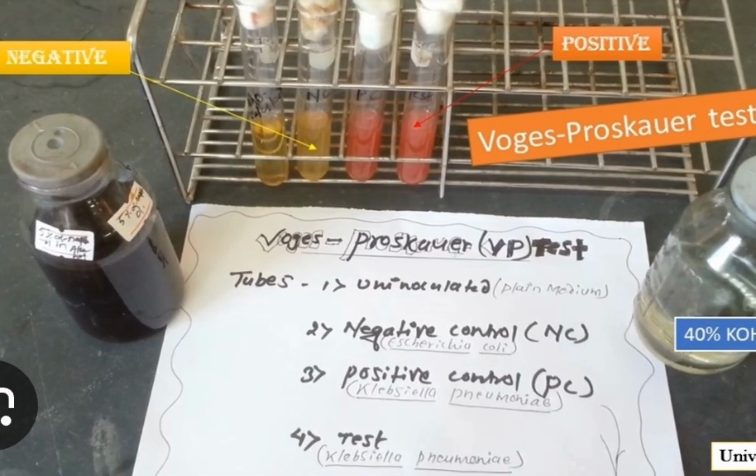So in the instance of your VP test, you are saying that the bacteria is able to break down the glucose, and it breaks down the glucose from glucose to pyruvate, and from pyruvate to acetoin. Now, when it breaks it down to acetoin, we find out that this compound can be oxidized into diacetyl.